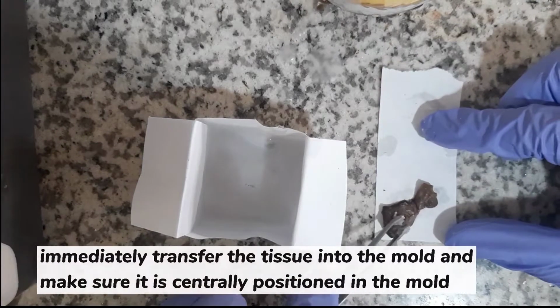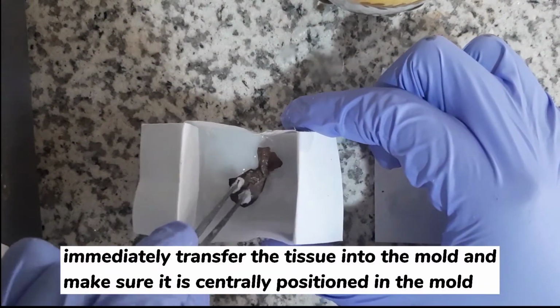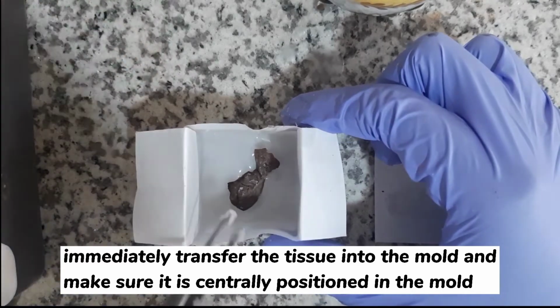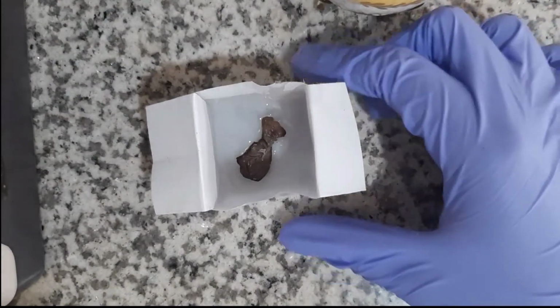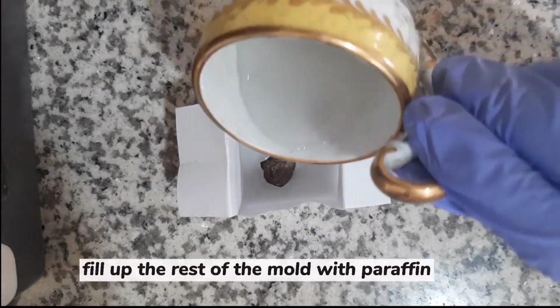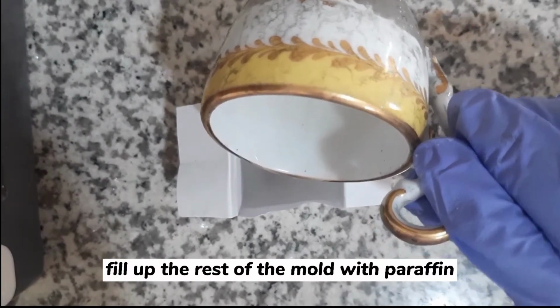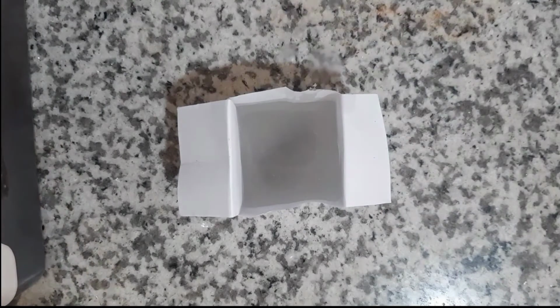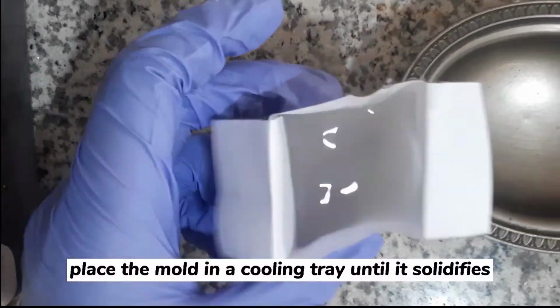Immediately transfer the tissue into the mold and make sure it is centrally positioned in the mold. Then, fill up the rest of the mold with paraffin. Place the molds in a cooling tray until it solidifies.